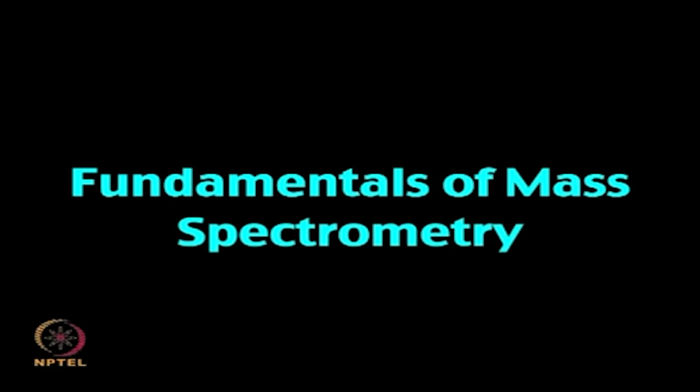Fundamentals of mass spectrometry. Mass spectrometry is a technique for protein identification and analysis by production of charged molecular species in vacuum and their separation by magnetic and electric fields based on mass to charge ratio. MS has increasingly become the method of choice for analysis of complex protein samples in proteomic studies due to its ability to identify thousands of proteins.